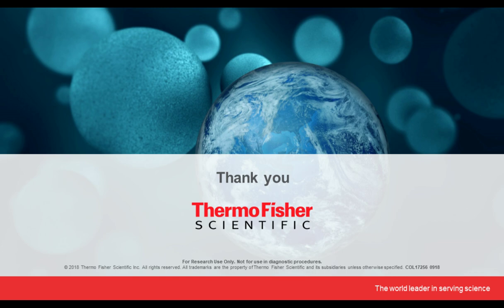We are performing protein-level immunoenrichment by validating the antibody by the IPMS method. You can also generate an antibody for a very unique peptide for each one of these targets, take the lysate, digest, and do the peptide-level enrichment.